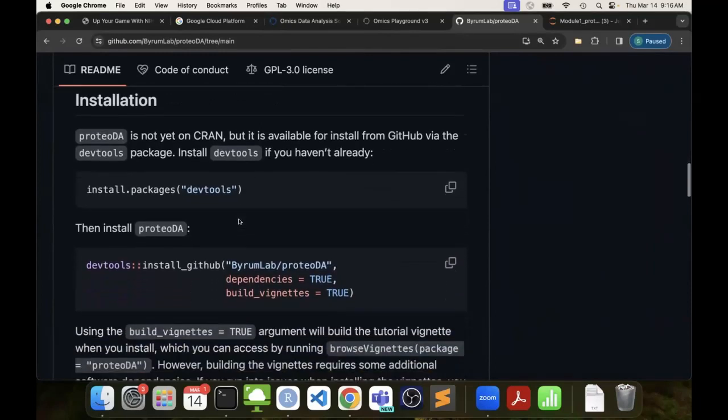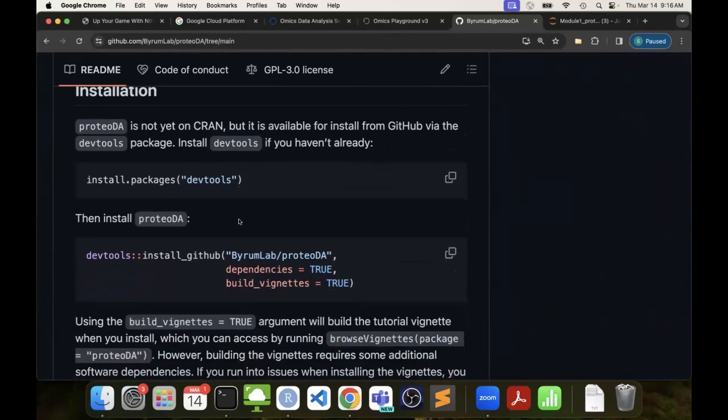Most R packages are on CRAN, and you can just do install.packages, like this code here, to install a package. There's over 7,000 packages now in R because it's community led. But because this is in a GitHub repository, it's not actually hosted on CRAN yet. We haven't made it to that level. I'm not that sophisticated yet. So we have to use devtools, your development tools package, to install it directly from my repository. This is how you're going to install it onto your local machine.